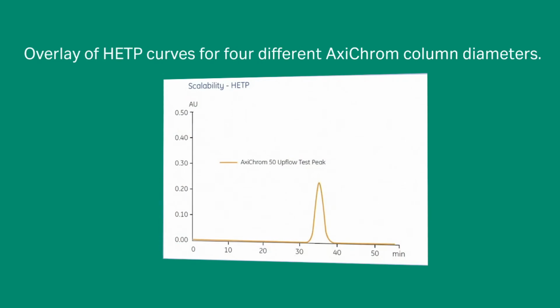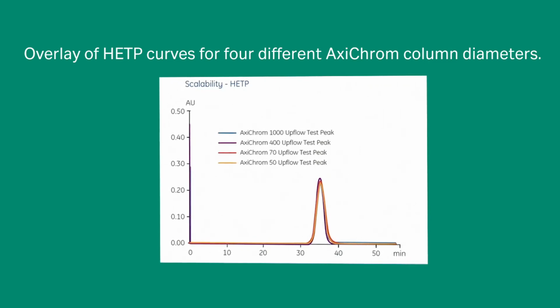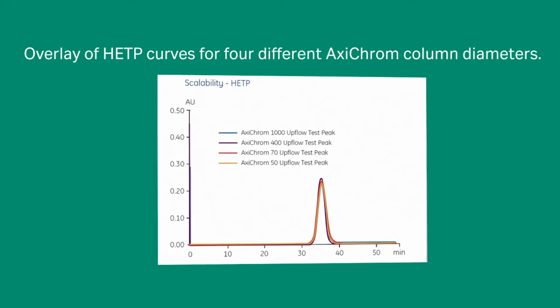As default, the method runs 2 HETP tests. These will start automatically after completion of the pack. Here we show 4 HETP curves from 4 different AxiChrom diameters, demonstrating the scalability of the platform.